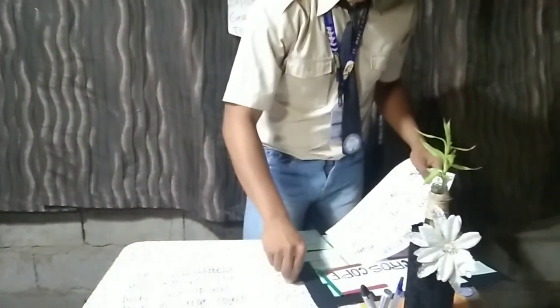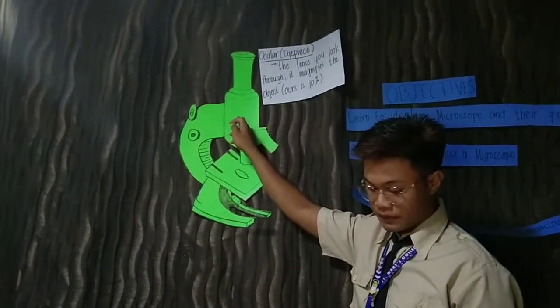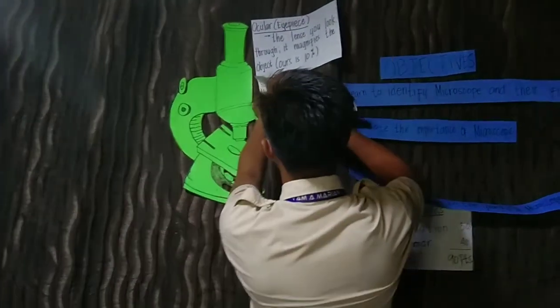Next one is the body tube. The body tube is in here.